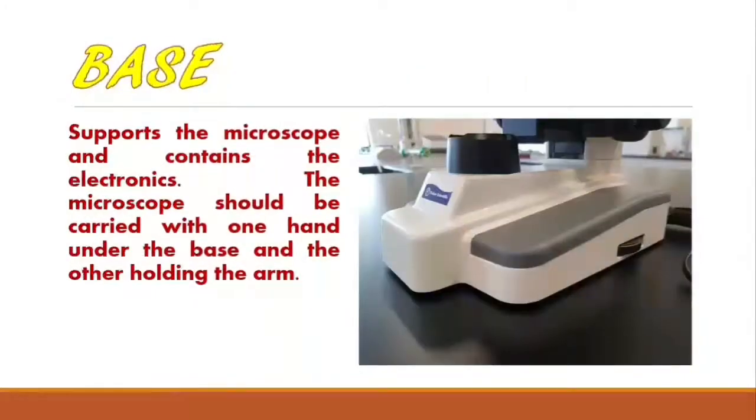Base. Supports the microscope and contains the electronics. The microscope should be carried with one hand under the base and the other holding the arm.